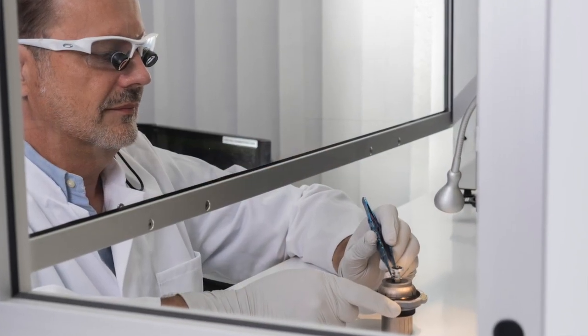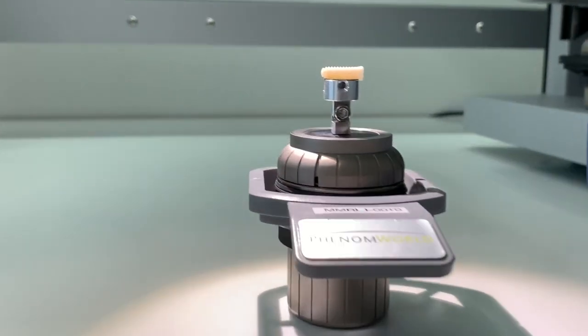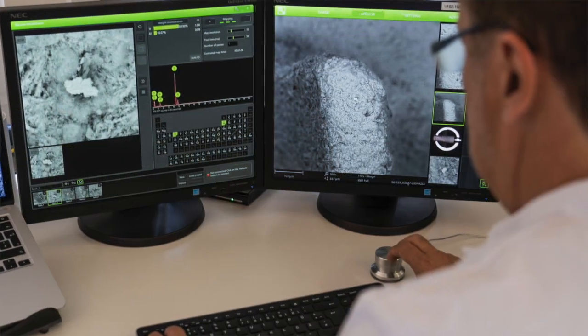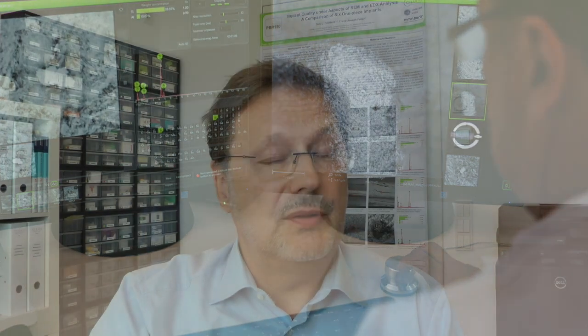In our recent quality assessment study, conducted in collaboration with the Charité University here in Berlin, we unpacked more than 100 different sterile packaged implants in a clean room environment, including ceramic and titanium implants, and performed with these implants elemental analysis of the surfaces in a scanning electron microscope. What I found in the microscope is presumably beyond your imagination.